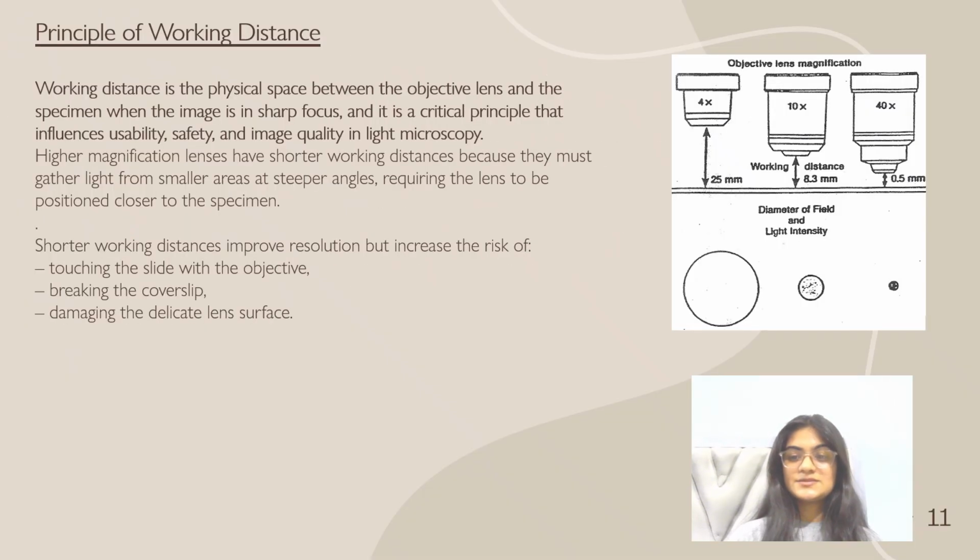Working distance is the space between the objective lens and the specimen. Higher magnification lenses require shorter working distances. While this improves resolution, it increases the risk of damaging slides or lenses. Careful focusing is therefore essential during microscopy.